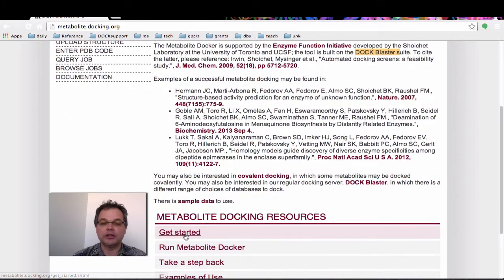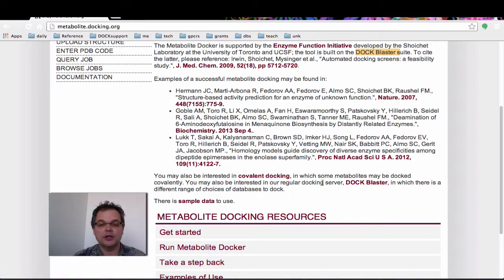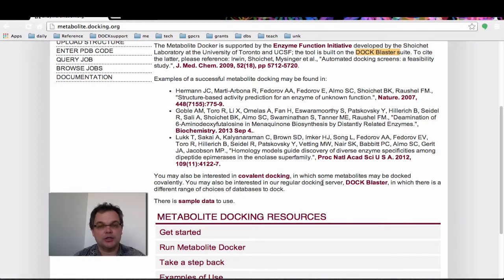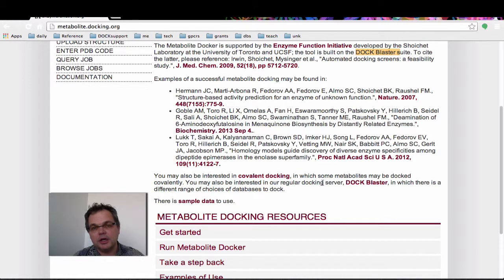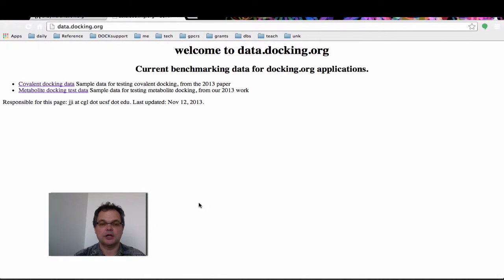We also have a covalent docking website where you can covalently dock metabolites, linked here. We also have our regular docking server, the DockBlaster server, which screens libraries of commercially available compounds — including metabolites — against protein binding sites. These binding sites can be taken straight out of the PDB or uploaded to our website.